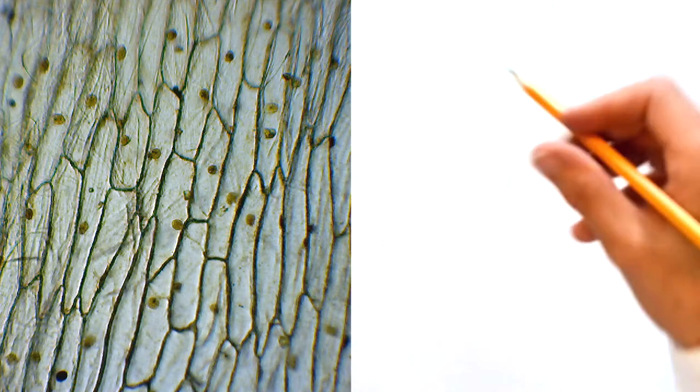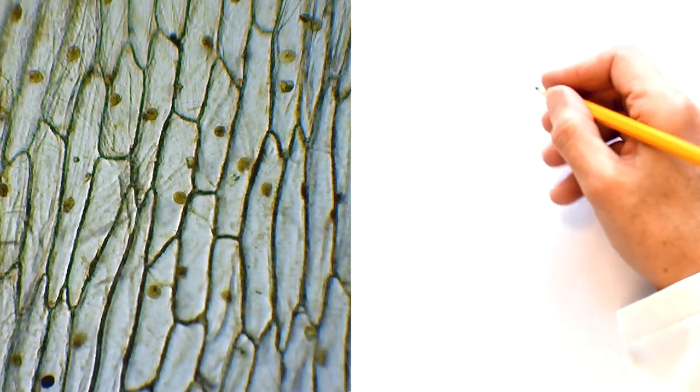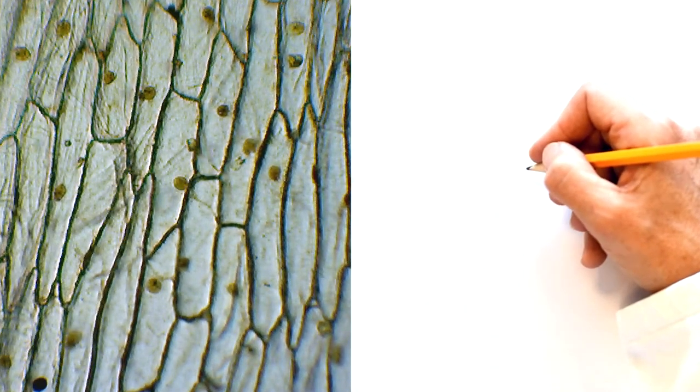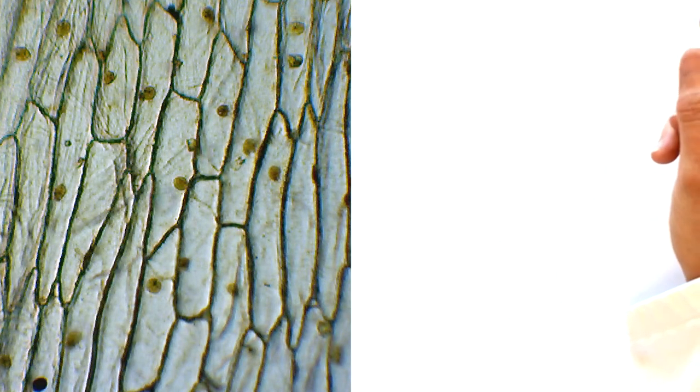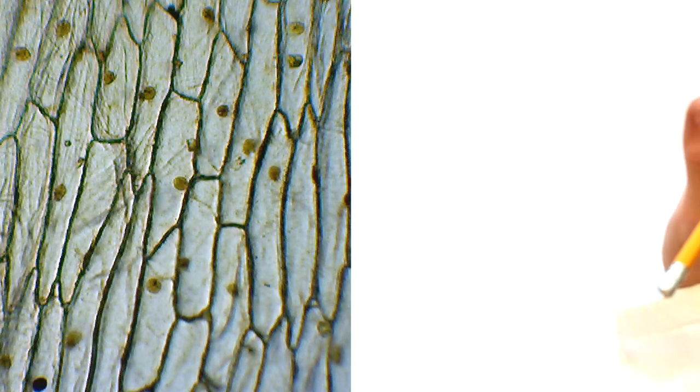Biological drawing however isn't about just showing what it is that you can see. We've got cameras to do that, but biological drawing is about observing what you can see and there's nothing quite like actually committing what you can see down the microscope onto paper. So this skill is not really about your drawing, this skill is about observation.